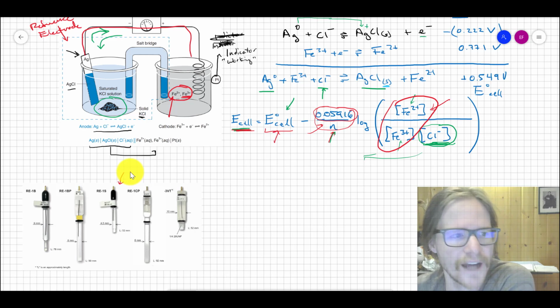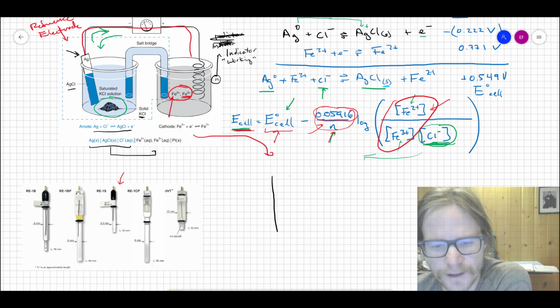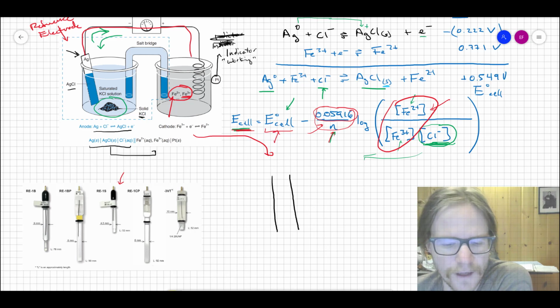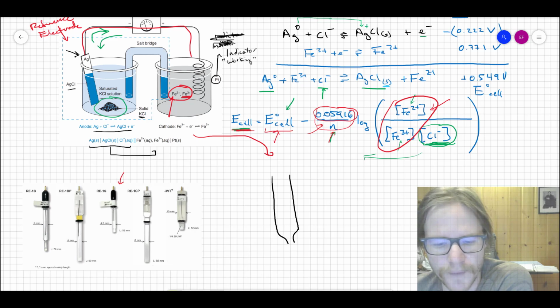So what this means is this dashed blue line, what we essentially do is take a tube of glass, looks like this. This would be the outer diameter of this, and then we pull it using glass blowing, so it pulls to a little taper like that. And then what we do, first thing, I'm going to do this in green.